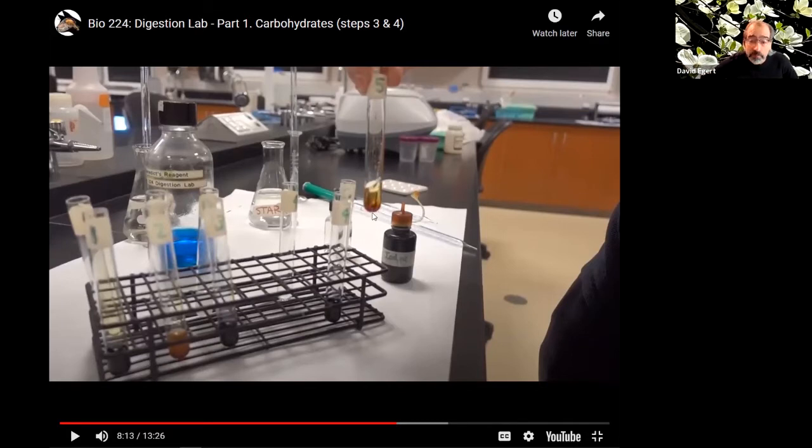So make sure, when you're writing stuff in your lab notebook, we have pictures for you. You can paste the pictures in and print them out. Actually, do that. Print them out and paste them in. But it is important that you don't just know yes or no starch, but how we got that. The lab practical tests on making sure you know the techniques in addition to more of the theoretical knowledge. So this was the 5 tubes using Lugol's iodine, and then we'll do the 5 tubes using Benedict's.